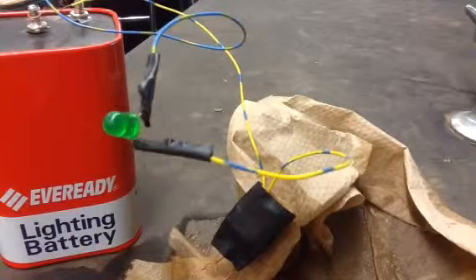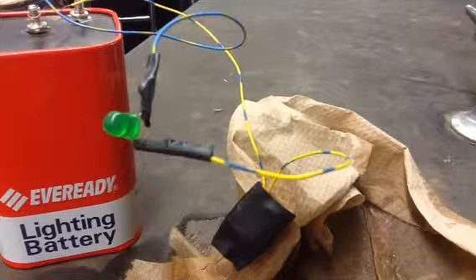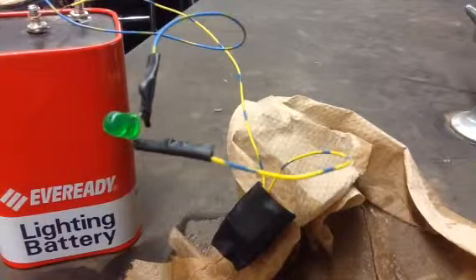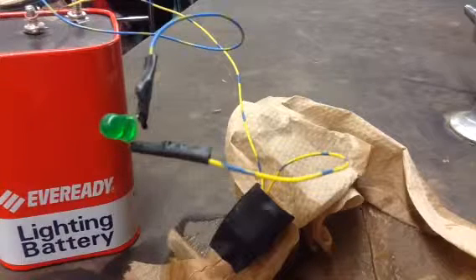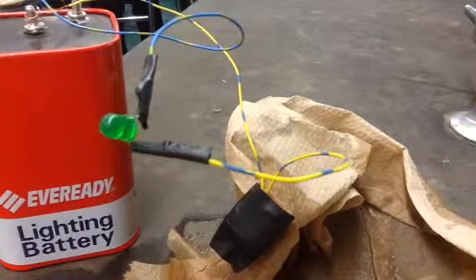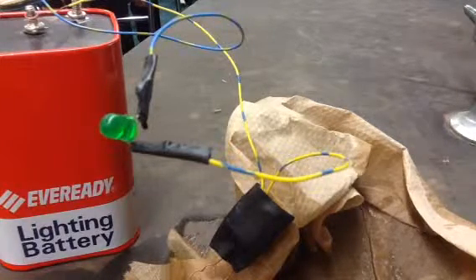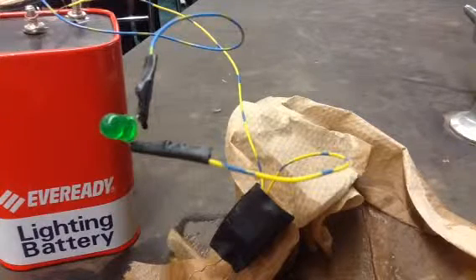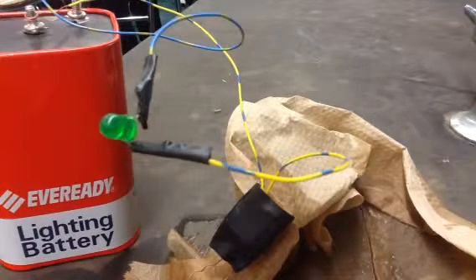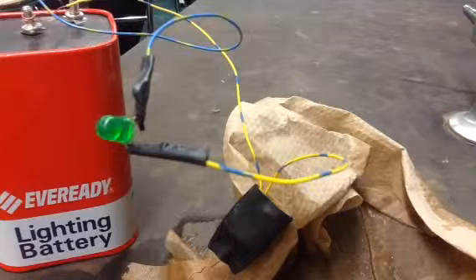What you can say is, lower melting points. So you have things that you're able to melt with a candle flame, and then there were things that you couldn't melt with a candle flame. Candle flames are a relatively low energy source. So you can look at low and high melting point. And what you're going to start to see is that with those 4 tests, some groups start to appear. All the things that had this also did this. All the things that are this are also this. So you're going to get 2 groups only. Not 4 groups, not 8 groups, 2 groups. Could there be outliers? Sure. Could there be things that don't fit, which of these things is not like the other in one of those categories? Yes. But overall, you should be able to reduce those into 2 groups.